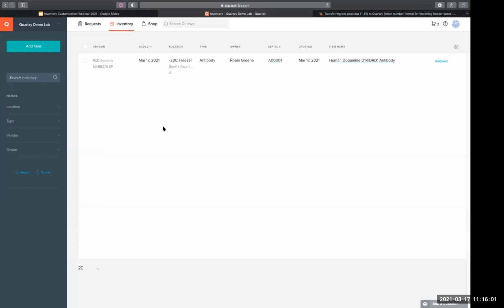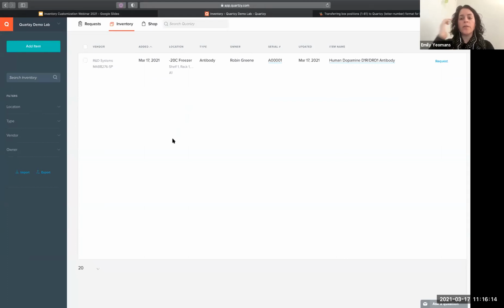I'll definitely bring that up with our product development team and let them know that this was brought up during the webinar, so they'll consider that for future development. Katie and I both work really closely with our product team, and we have a really active product team. So we're always looking for really good feedback like this. So definitely keep these ideas coming and let us know how we can be better for you.